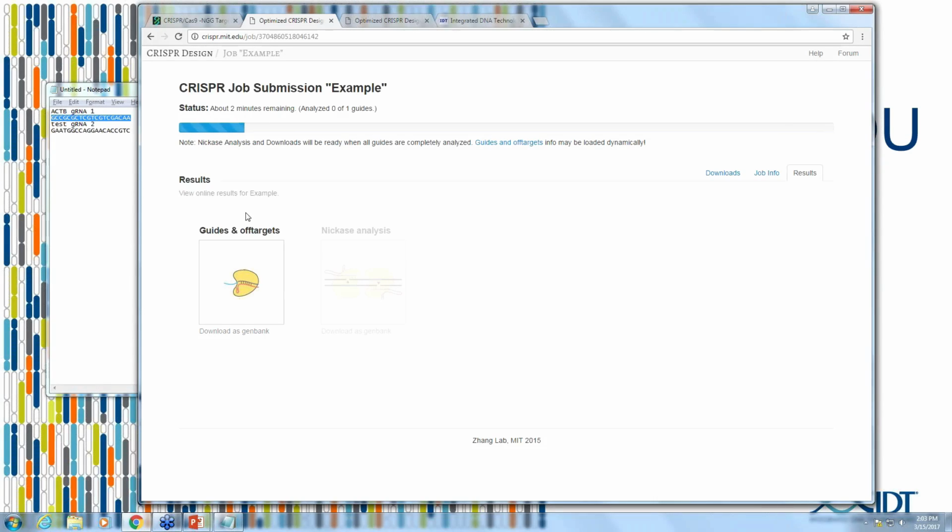Okay. All right, the next question I have, I've got a couple of delivery questions here for you. So for homology-directed repair, you have your HDR template. If you add that to the transfection or electroporation of your ribonucleoprotein or guide RNA, Cas9, whatever form you've chosen to do that in, does that extra molecule impact the effectiveness of the transfection itself? That's a really interesting question, and what we've seen is for electroporation delivery in particular, the presence of that extra DNA molecule can actually help improve the rate of delivery.